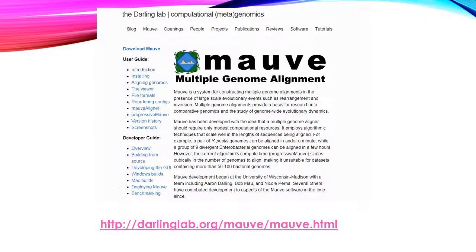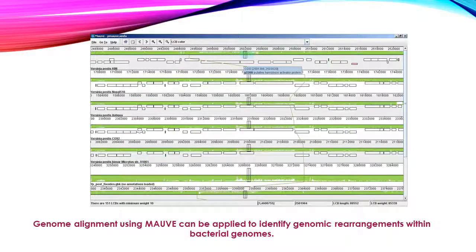Mauve can conduct multiple genome alignments. It will run from your Windows or Mac operating system, and the URL for this software is available at the provided link. Once you download Mauve onto your system, you can enable it to align two genomes and identify differences between them. The typical Mauve output is shown here. Mauve is very useful when you want to identify rearrangements of the genome.